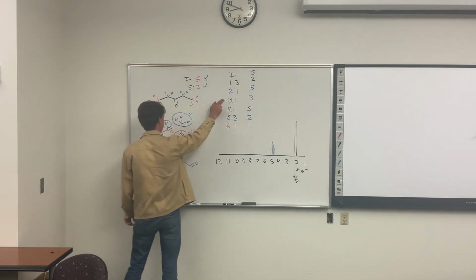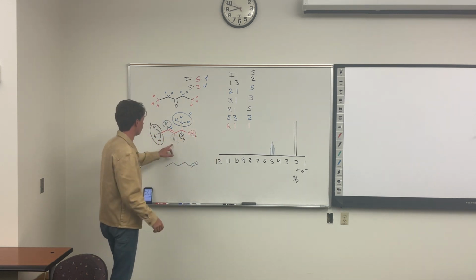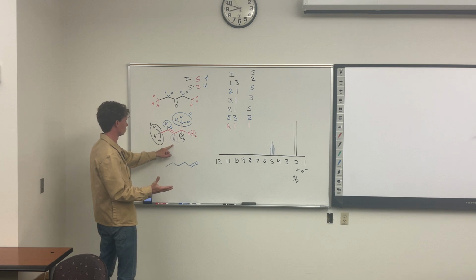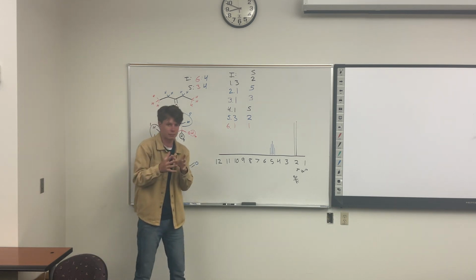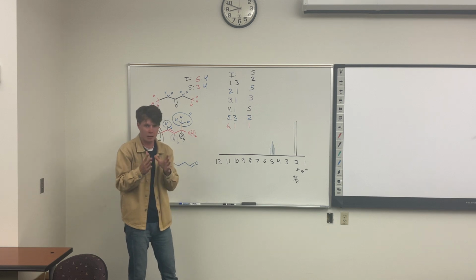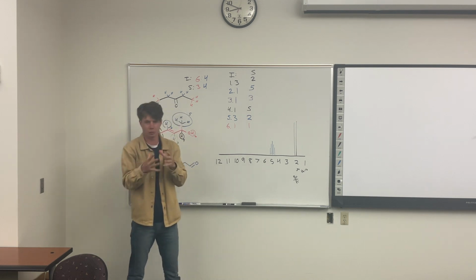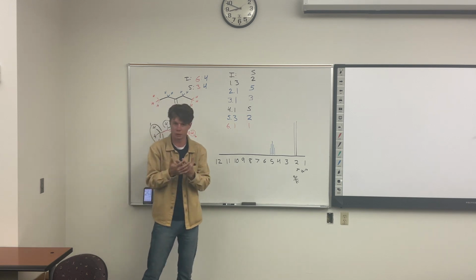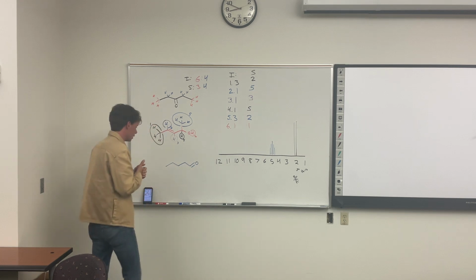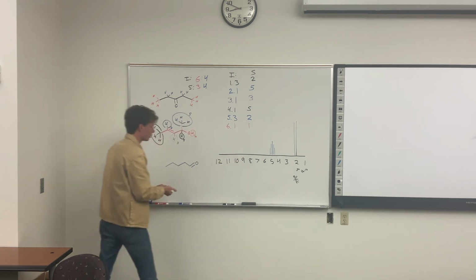Next, let's look at purple. Purple is also vinylic, and that's it. So right around, and this is where we kind of get into that gray area, you'll probably have multiple signals showing up. So on the ACS, they're going to avoid that. In real life, it gets messy, and they overlap and interfere with each other. So we're going to draw it probably over top of number 5.